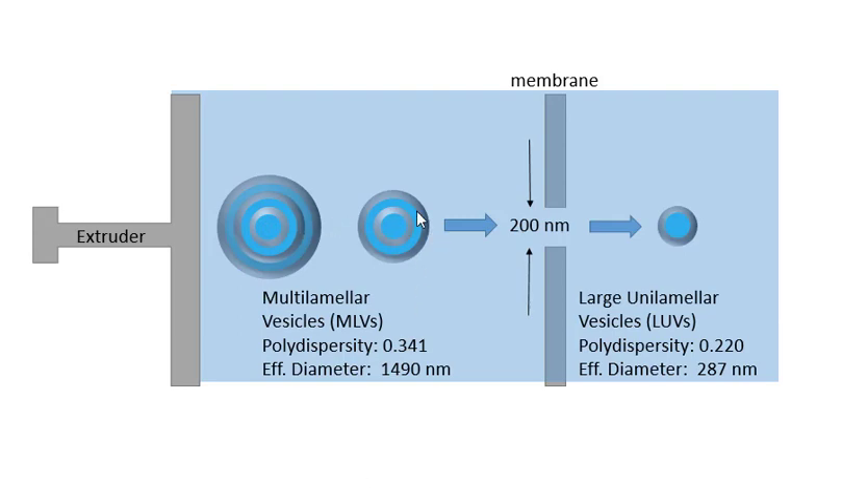In the next step, we're going to take these MLVs — the multiple lamellar vesicles — and pass them through a membrane that has pores of approximately 200 nanometers in a device called an extruder. You simply push on the syringe, which pushes the MLVs through and converts them to large unilamellar vesicles. The polydispersity should be low compared to the initial MLV mixture, and the diameter should be about 200 nanometers. You'll measure the polydispersity and size using dynamic light scattering.